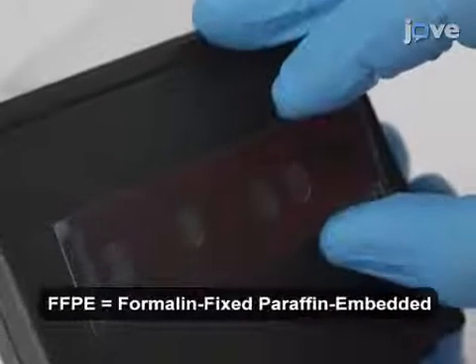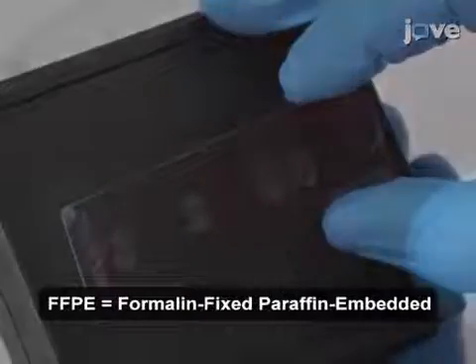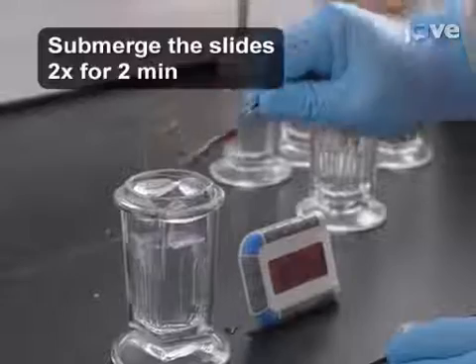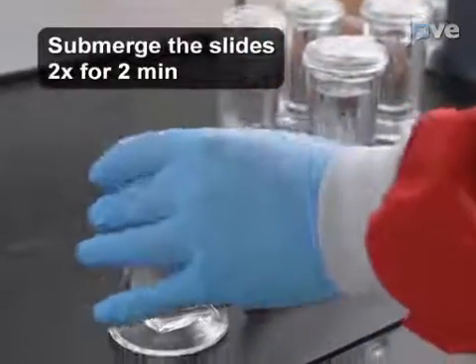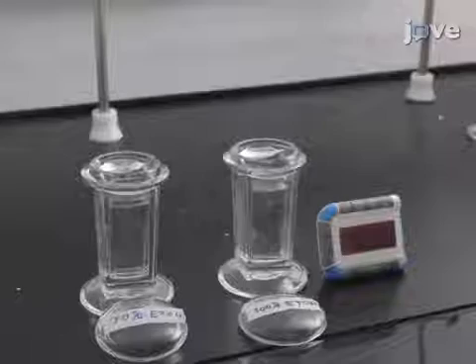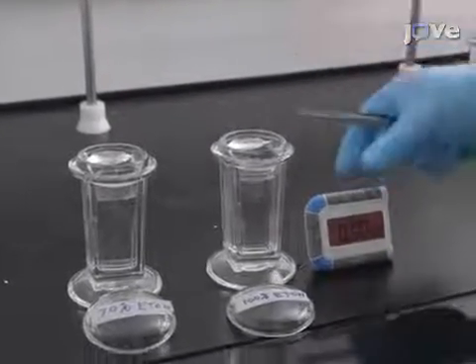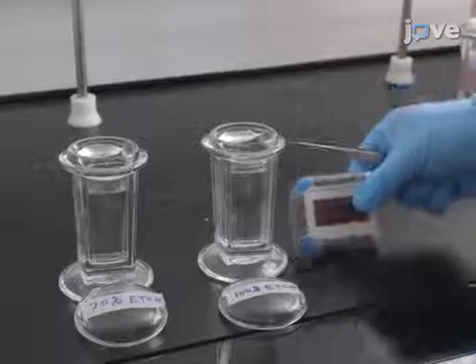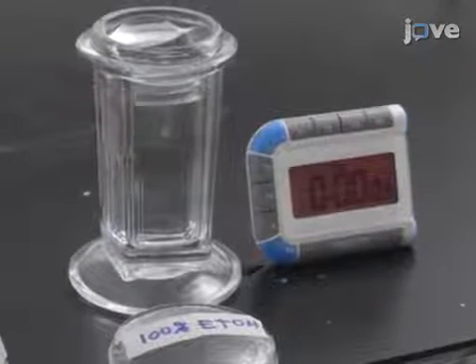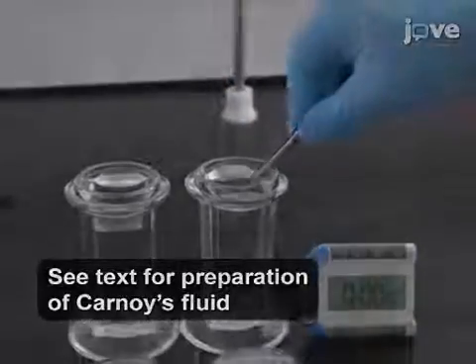For FFPE tissue, float mount the sections onto the nitrocellulose pre-coated ITO slides as described in the text protocol. Submerge the slides in fresh xylene to remove residual paraffin for 2 minutes. Wash the deparaffinized samples by submerging the slides in a graded solvent series consisting of a 70% volume for volume ethanol water solution followed by 100% ethanol for 30 seconds. Then, submerge the slides into Carnoy's fluid for 2 minutes.